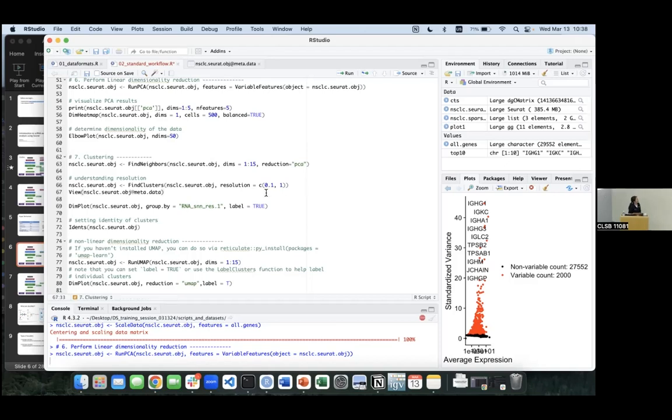Yeah, I want this workshop to be a little bit more coding so that you really understand what's behind the code instead of just copy pasting everything and then changing your object name. I hope everybody can follow here. Still kind of stuck. I'm gonna move forward to explaining the clustering part.